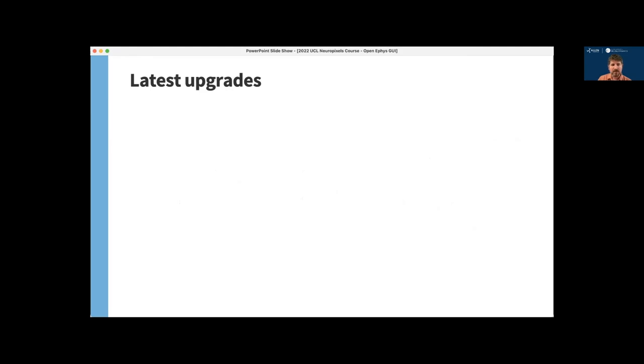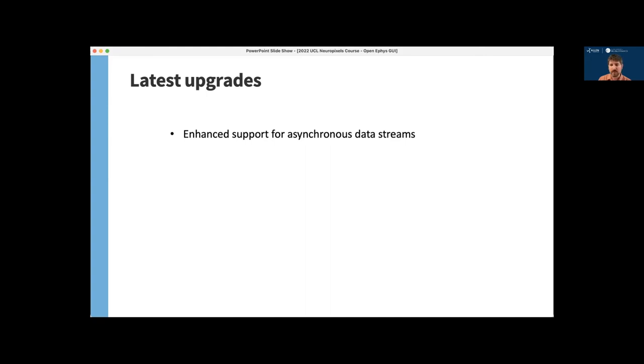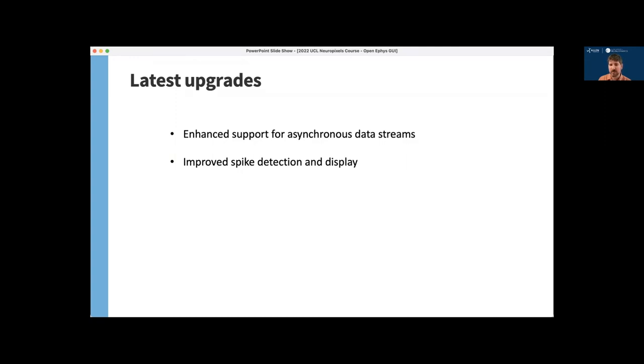And finally, I want to mention that the latest version of the GUI has a number of changes that make it even easier to use with Neuropixels probes, including enhanced support for asynchronous data streams. So this makes it much easier to update settings on a probe-by-probe basis and allows you to automatically synchronize data across streams, improve spike detection and display, which I showed you briefly. This can efficiently process spikes across all 384 channels of Neuropixels probe.